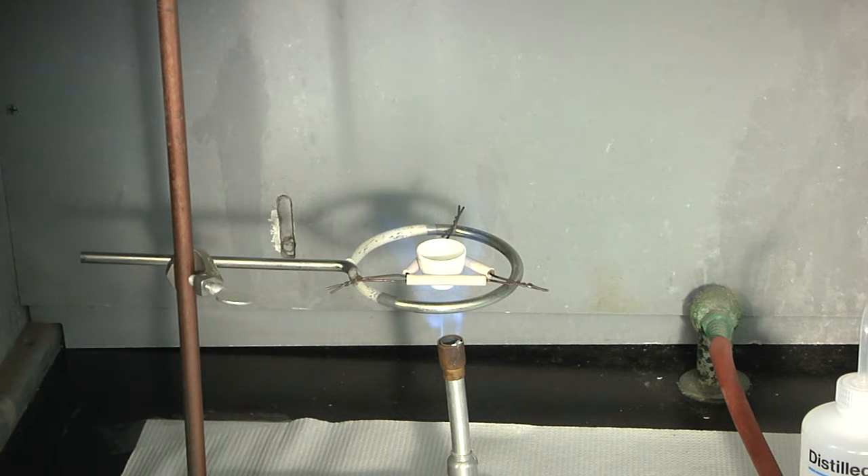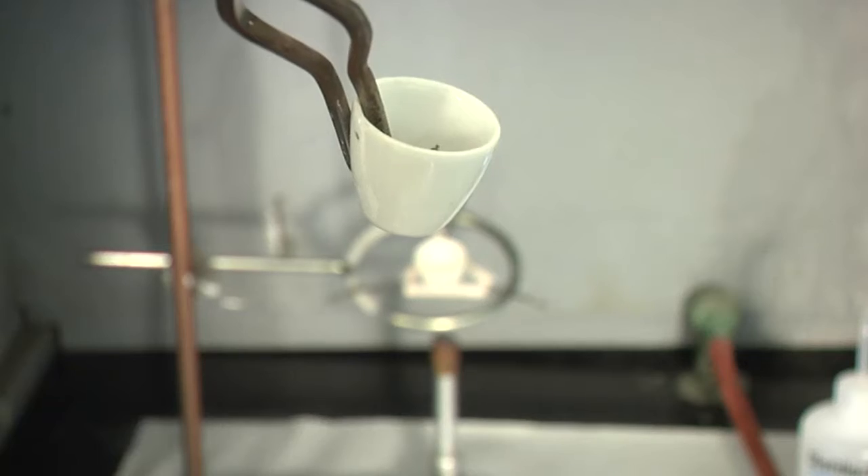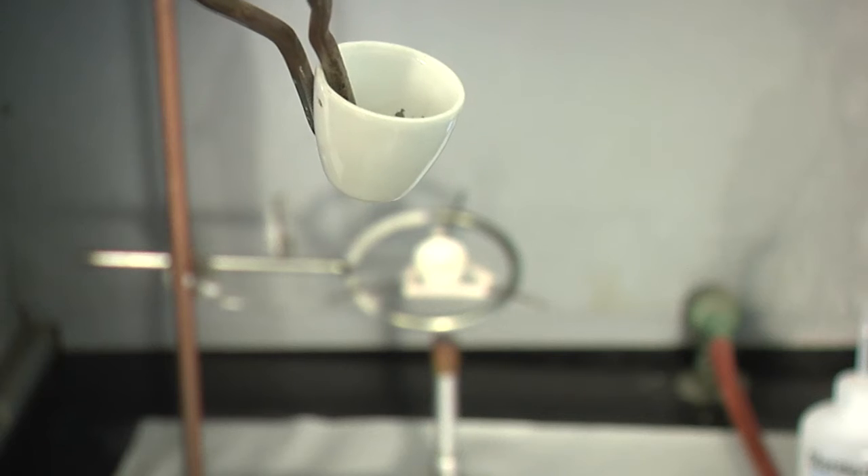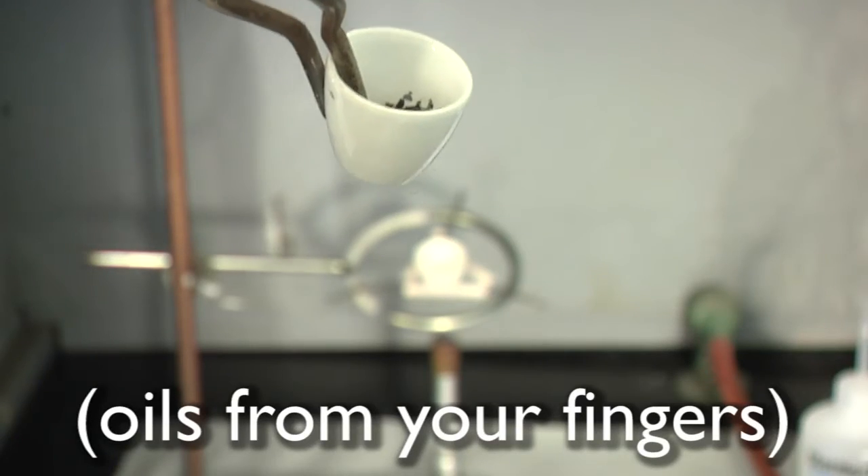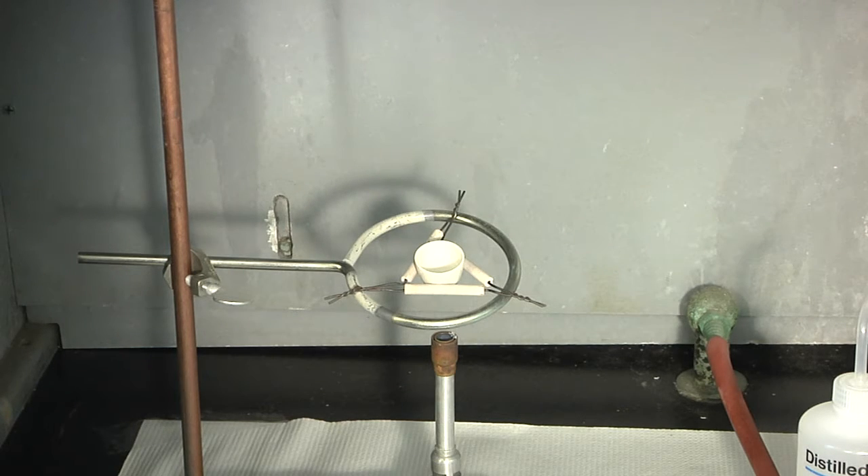Seriously, turn up the heat. Handle the crucible with your tongs in order to avoid getting oils and extra weight on the crucible. Allow the crucible to cool and weigh it.